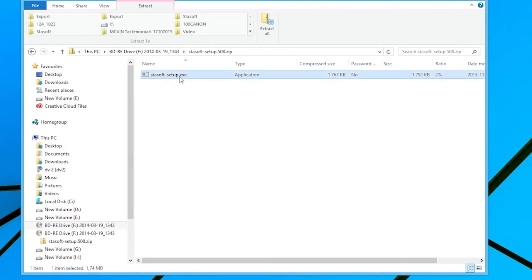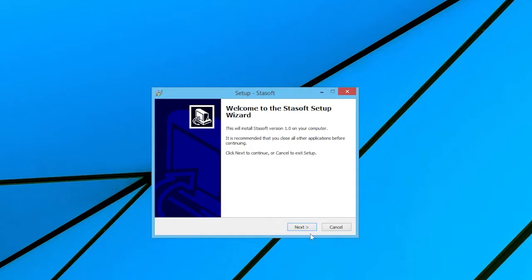Running this executable file, the Welcome to the Stasoft Setup Wizard window appears. Depending on the user's antivirus software installed on his or her computer, the user may be asked to allow the program to make changes to his or her computer.